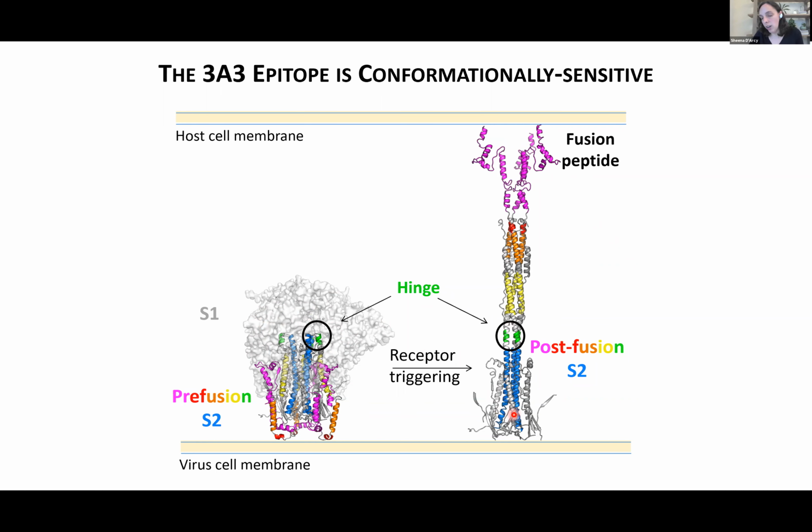I see one, I think that was left over from last time, which is, can you comment on the utility of ion mobility to HDX experiments? Sure. So we have a mass spectrometer that does do ion mobility. So we do use it when we are searching our data. I have not done a deep dive analysis, if we didn't use it, how that would affect our coverage of the protein.